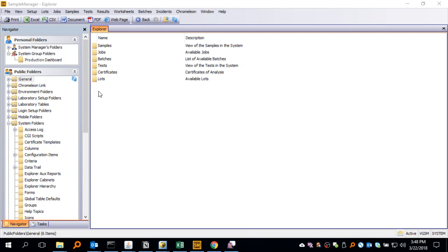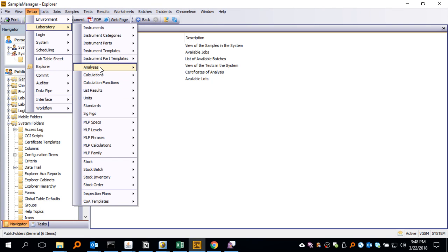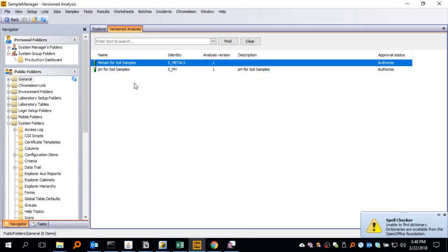Hi and welcome. In this video I want to introduce you to something we touched on very briefly, and that is component lists. I'm going to go ahead and get into Setup Laboratory Analyses. Let's go ahead and open our analysis list.